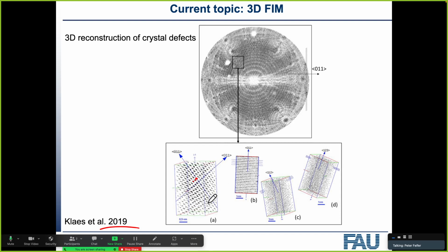Nowadays, people are also doing that in electron microscopy. But at the time, not that long ago, this was really only done in field ion microscopy. So remember, this is a technique that's now bordering on 80, 90 years, and is still producing useful new results.